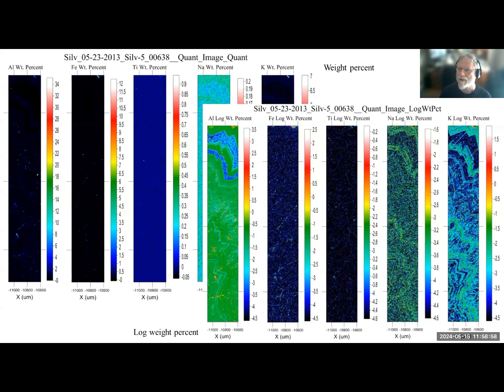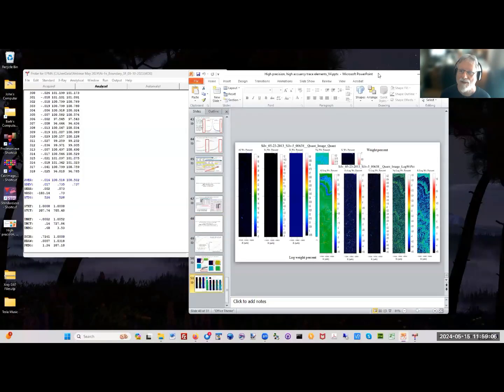And now all this incredible detail pops into view. So I'll leave it there, because it's a pretty picture, and I will take any questions, or we can open up for general questions if people like.